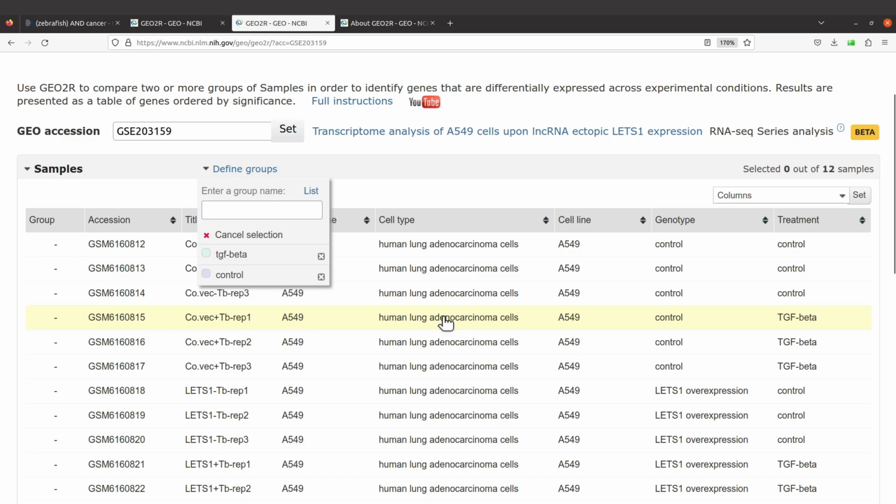But if you click one and you click the other, you will see that the color has moved to the one that you clicked on. All right, so if you are selecting more than one sample, then you have to also use the control key. So let's say I have selected this one. Now to select the other one, which is this one here, I'll press the control key and then I'll click it. So you'll see that both have been selected.